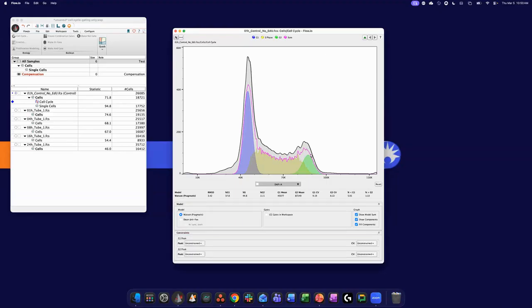If the colors are distracting for you or something like that, you can always use these graph toggles here. So if you want to turn off the model summary, or the components, you can do that. If you don't like the shading, right, you can do just solid lines, though it does get a little hard to tell when two lines are overlapping, but if you prefer that, you can do that as well. Okay, so a lot of stylistic things here.